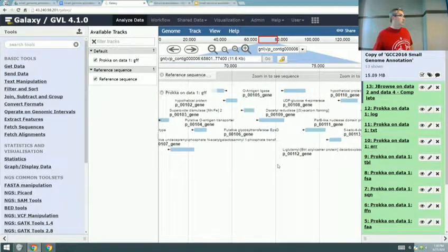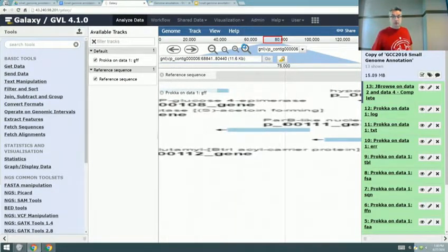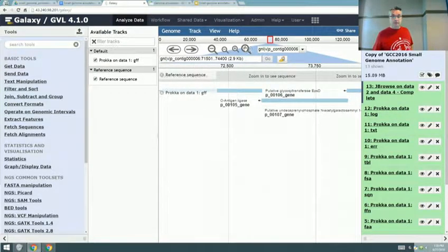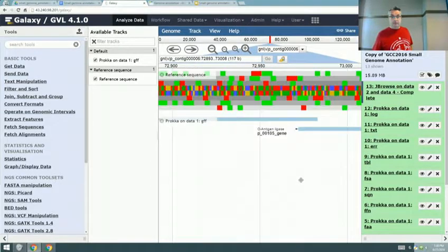And there's all sorts of other ontologies besides GO. I know there's COGs, which are an old uncurated system, but COG has about 20 categories of genes, and a lot of people know COG coloring, so they would want to color their genes like COG colors and things like that. So you zoom into the reading frame so we can exhibit the problem.